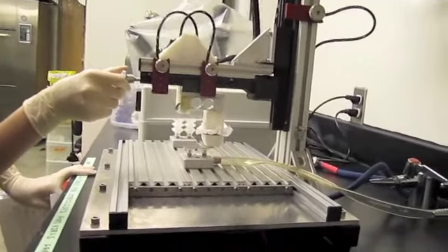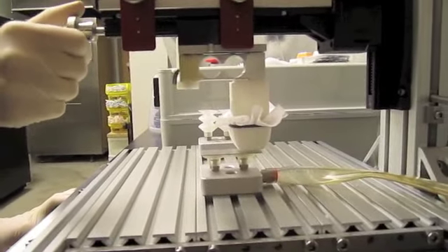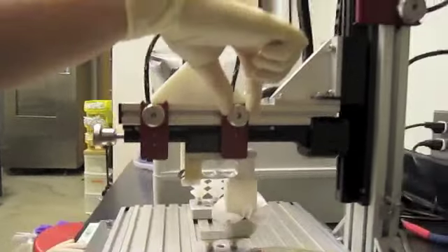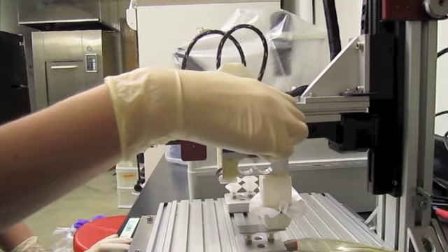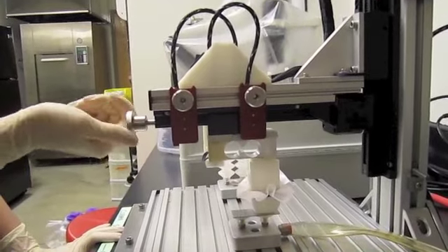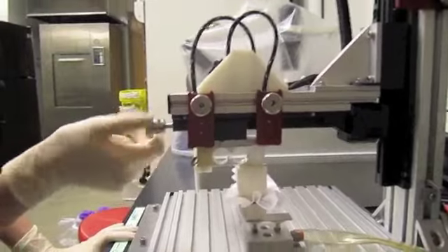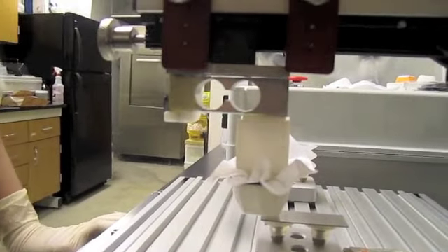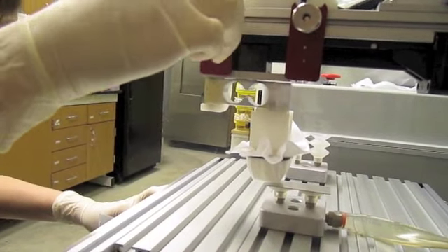Turn the silver knob on the front of the horizontal column, moving the swiping surface to your desired start position. Then, loosen the side knob closest to the vertical column, allowing you to move the red metal piece until you feel it contact the notch in the metal carrier. Now, turning the silver knob again, move the cube to the desired end point. Then align the other red metal piece with the notch in the metal carrier. Finally, tighten both side knobs, setting your horizontal start and end points.